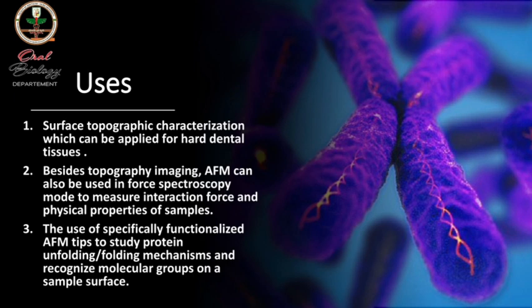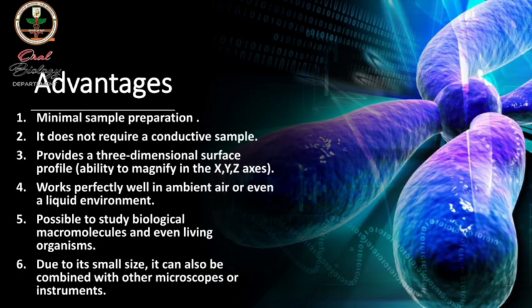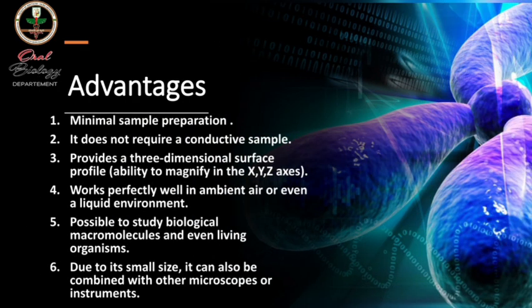Moving to the advantages of this technique, it requires minimal sample preparation. It also requires no conductive sample, which could otherwise affect the preparation techniques. Also, it provides a three-dimensional surface profile, with the ability to image in the XYZ axes.